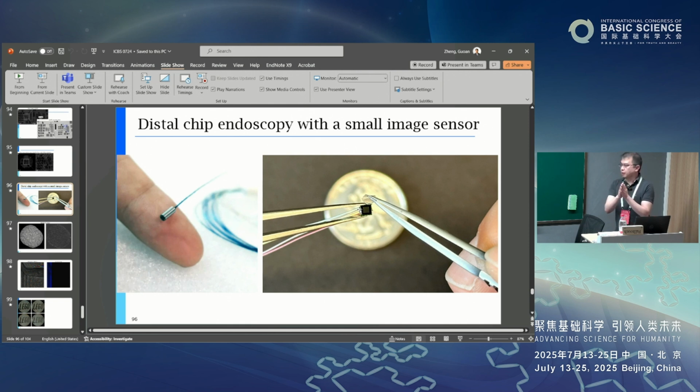You can detect it with your device, just like the conventional optical microscope, but in a sense that you don't need to make a huge lens, you don't need to correct for aberrations, you don't need to make bulky optics elements. You just make a very thin layer of surface, just like a metasurface, or whatever they call it. But for us, we just need a random surface that is uniform and thin and contains very small particles to modulate the light.